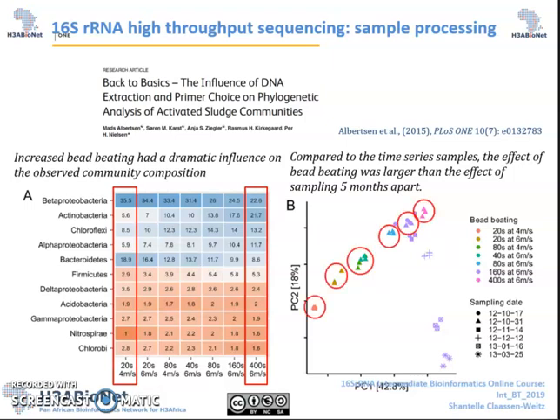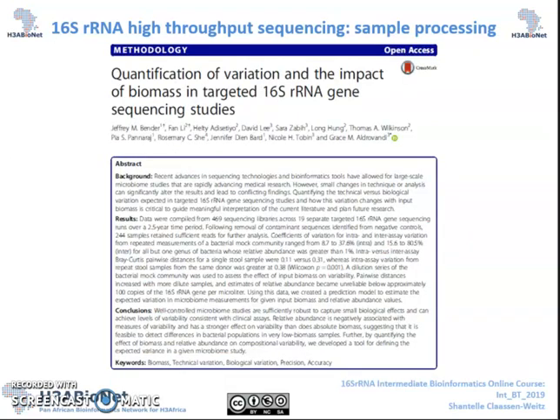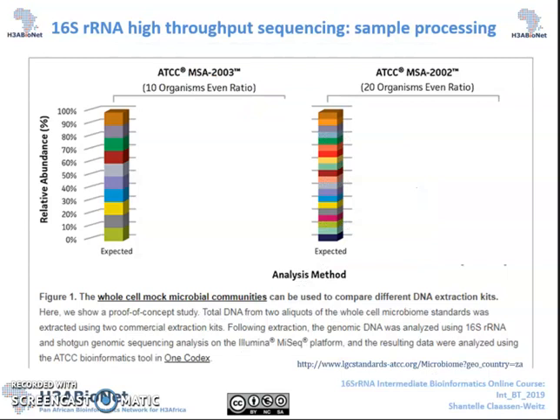It is important that once you have identified a DNA extraction method, you continue with the same method throughout the course of your project. Studies have also previously shown that the lower the DNA yields extracted from a specimen, the less reproducible the sequencing results. One way of evaluating your extraction protocol is to include microbial mock communities.